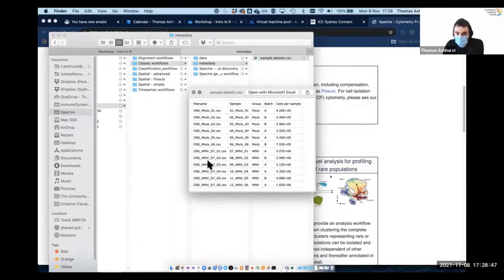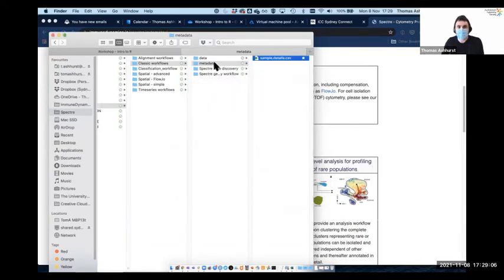We want to know which sample belongs to each group. We can also include all kinds of other things, batches, cell counts, whatever relates to each sample, we can add in here. If this was clinical data, this might include age, sex, and all kinds of other clinical measurements. And then we have a folder here with our script.